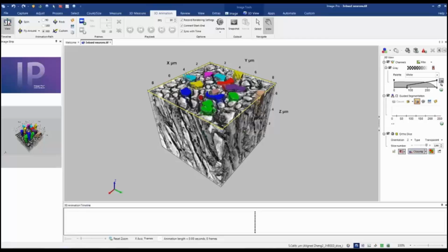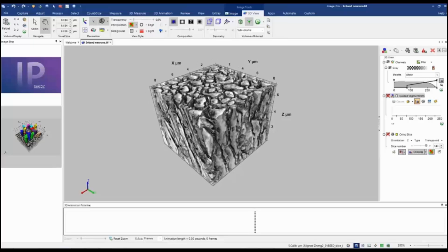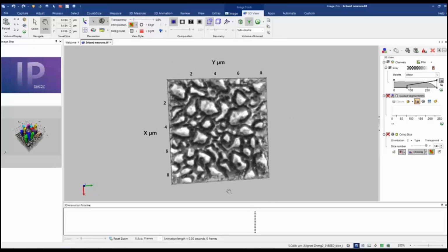We include everything, so it could be just camera position transitions, or it could be transition of slices, transitions in transparency, or transition in opaque levels of the palette. Everything can be animated.